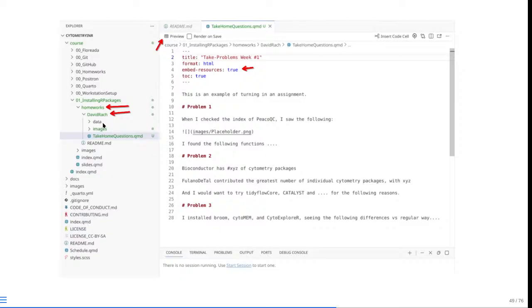So we kind of emphasize keeping things organized. So if you have a subfolder for data, include the data folder there. Remember, each file that you submit has to be less than 50 megabytes. You can't submit your very large FCS files. I don't particularly want to crowd up the GitHub with like 1 gigabyte size FCS files, so keep it on the relatively small side. Images are for if you take screenshots and you integrate those screenshots in your Quarto document, this is where they would be at.